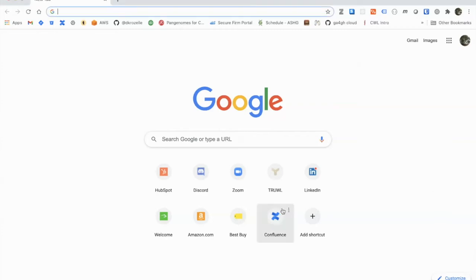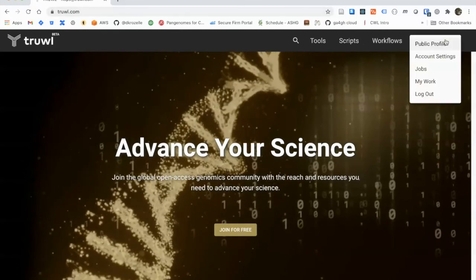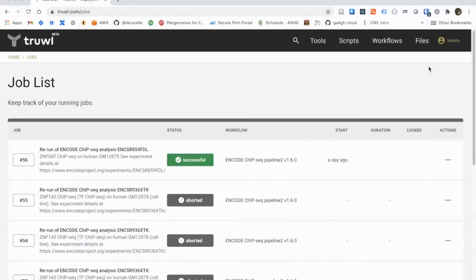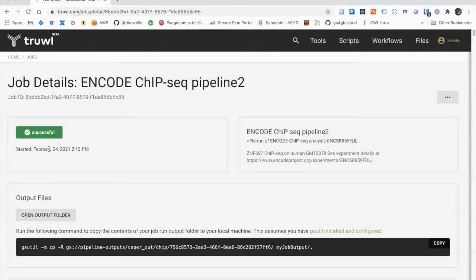Okay, so I got an email saying that my job was done. So I closed the window out last time, which is perfectly fine to do. So if I go back to Truwl.com, it remembers that I'm logged in here, and I can just go to my jobs. And you can see I was playing around with some other stuff and aborted some other things, which is perfectly fine to do. And it's telling me this job was successful, so that's good. So you go here. This is the screen you would see if you had just left the window open.